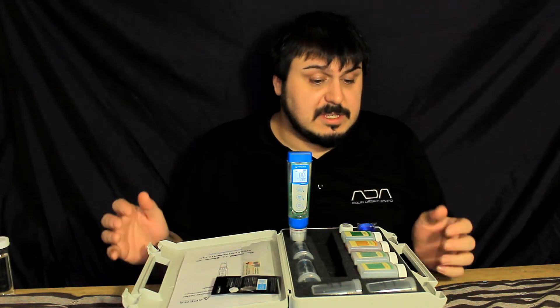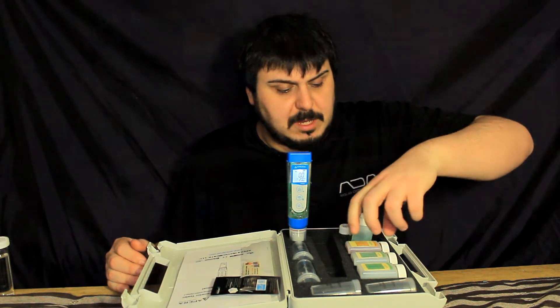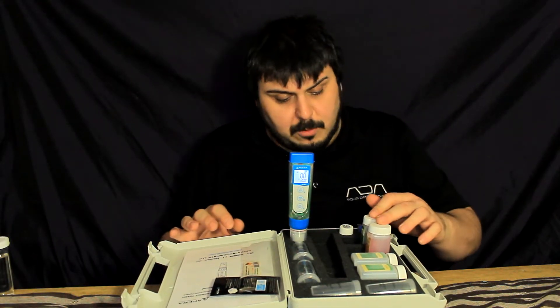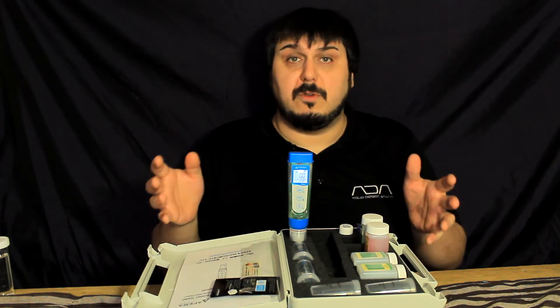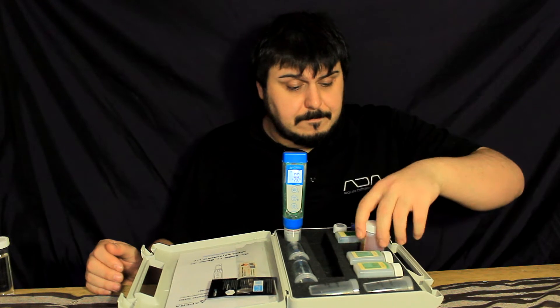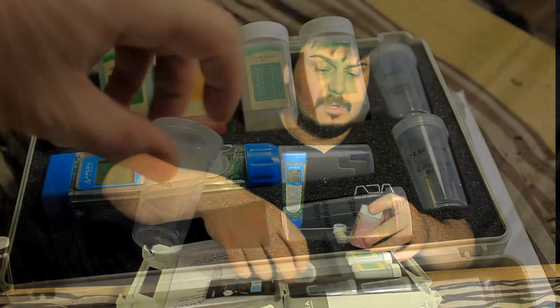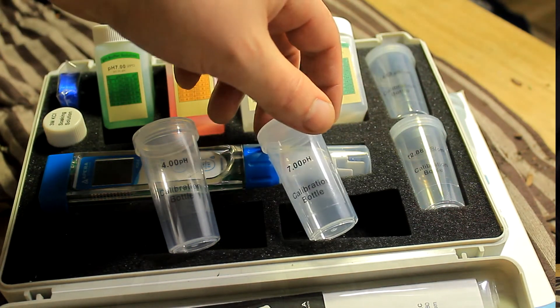Taking a close look, you can see it comes with quite a few things. It comes with buffering solution — pH 7 and pH 4 — which gives us a two-point calibration. This meter is capable of doing a three-point calibration at pH 4, 7, and 10, but it does not come with the pH 10 solution, so if you want that extra level of precision you'd have to purchase it separately. These solutions can be used about 10 to 15 times, and every time you pour a sample you can leave it in these jars. These are the calibration jars for pH 4 and pH 7.